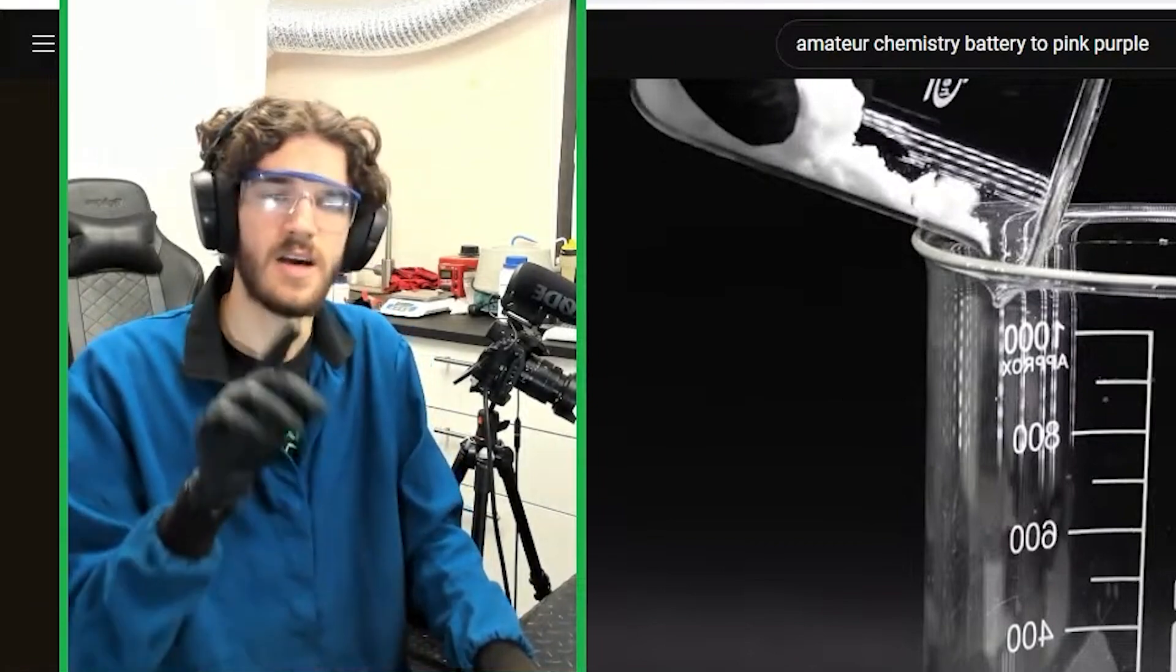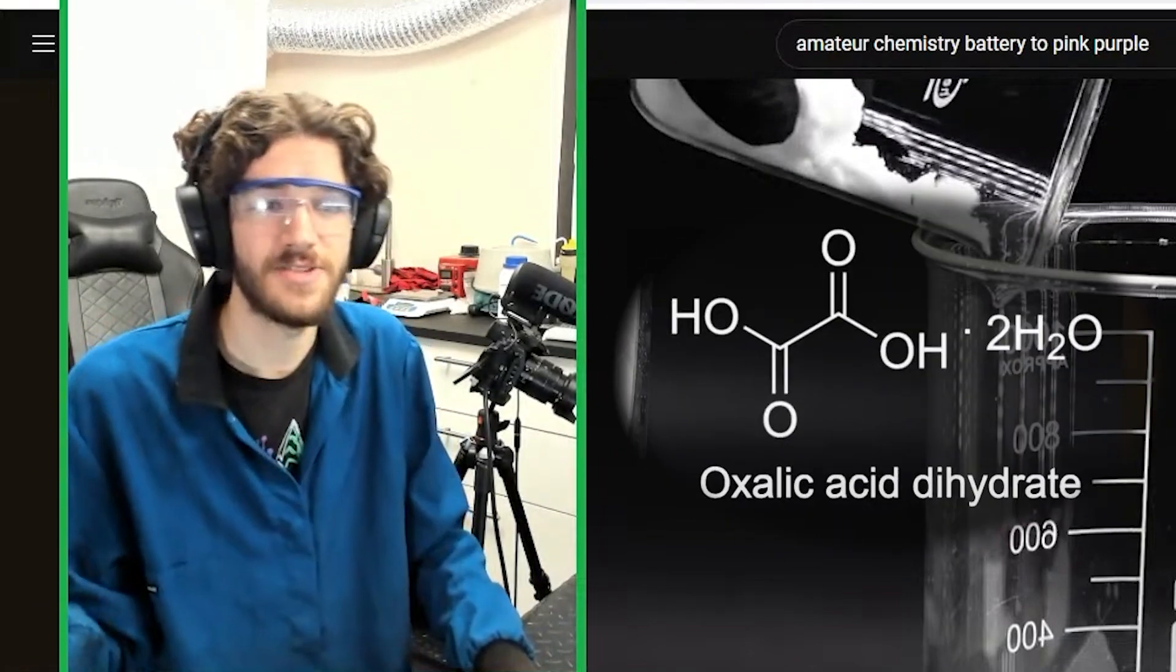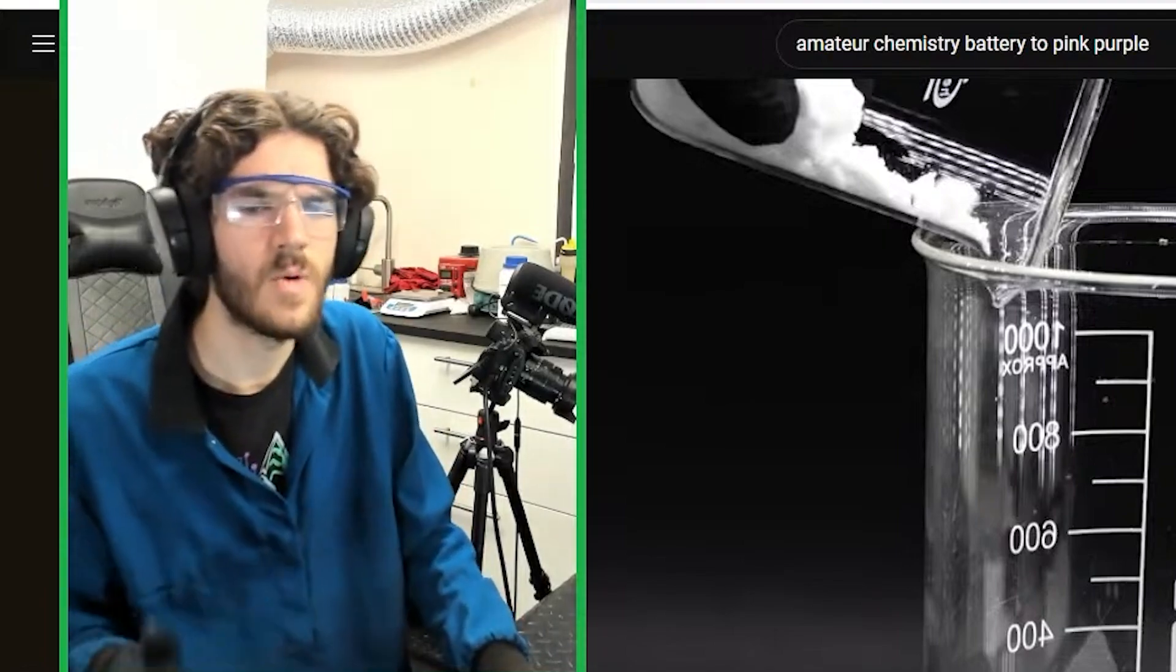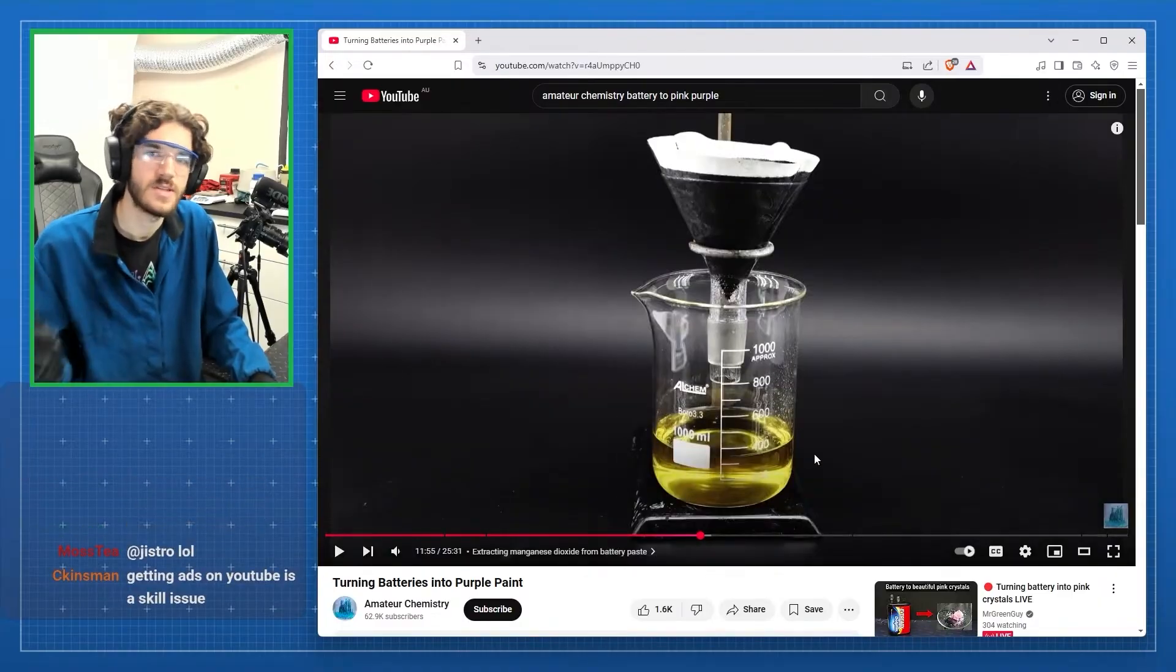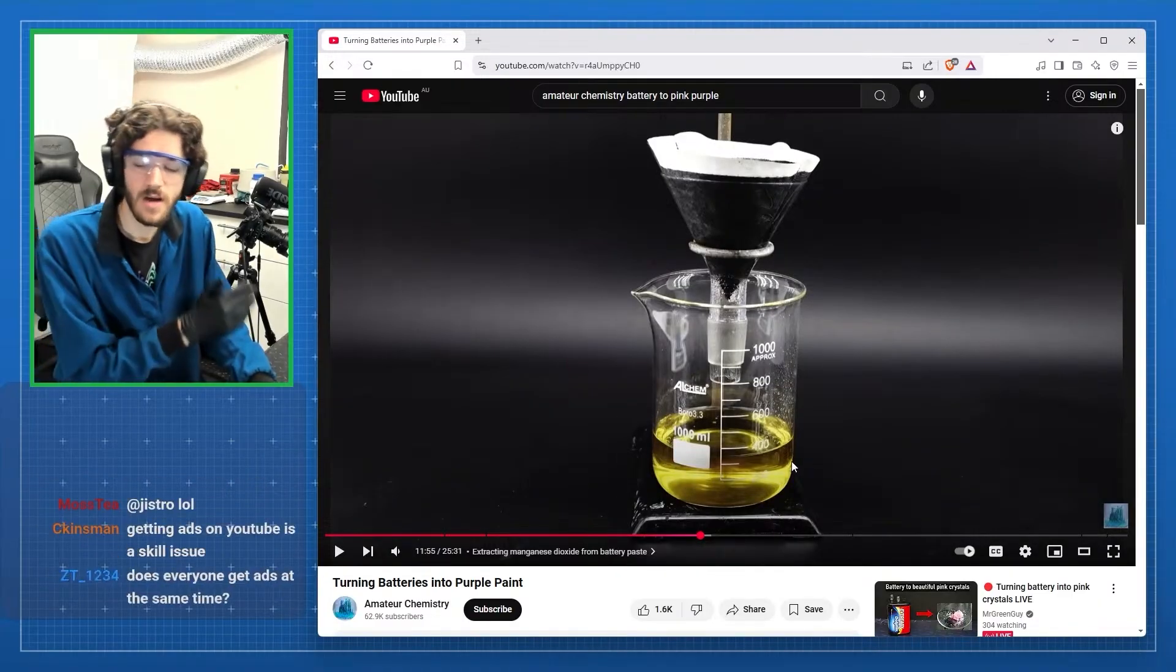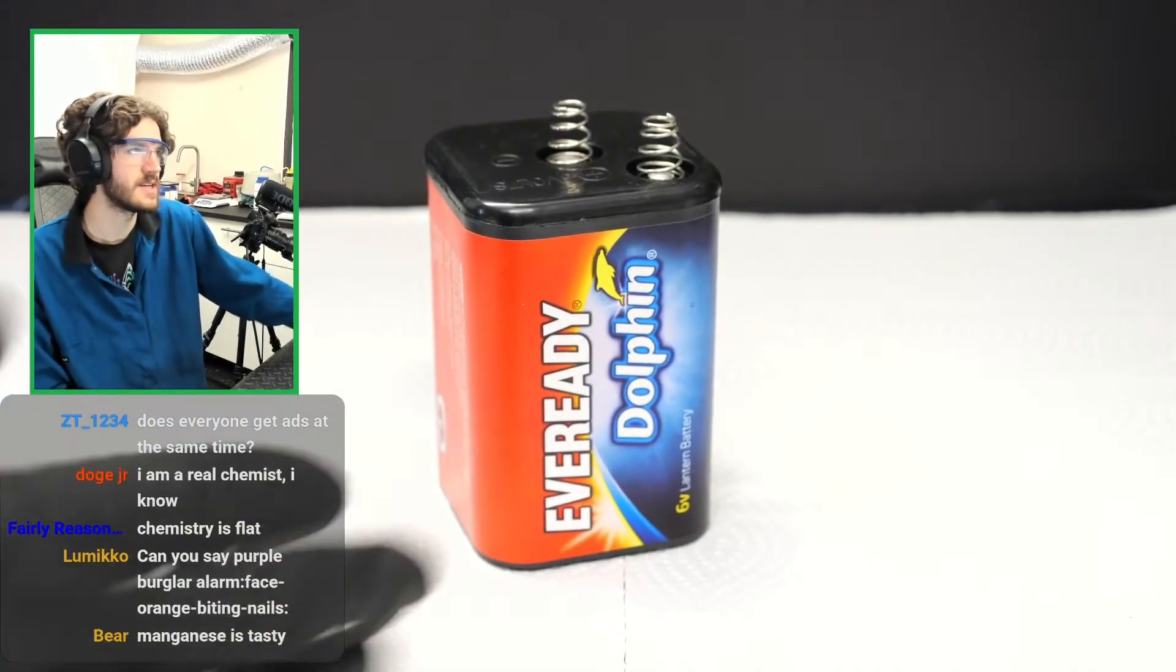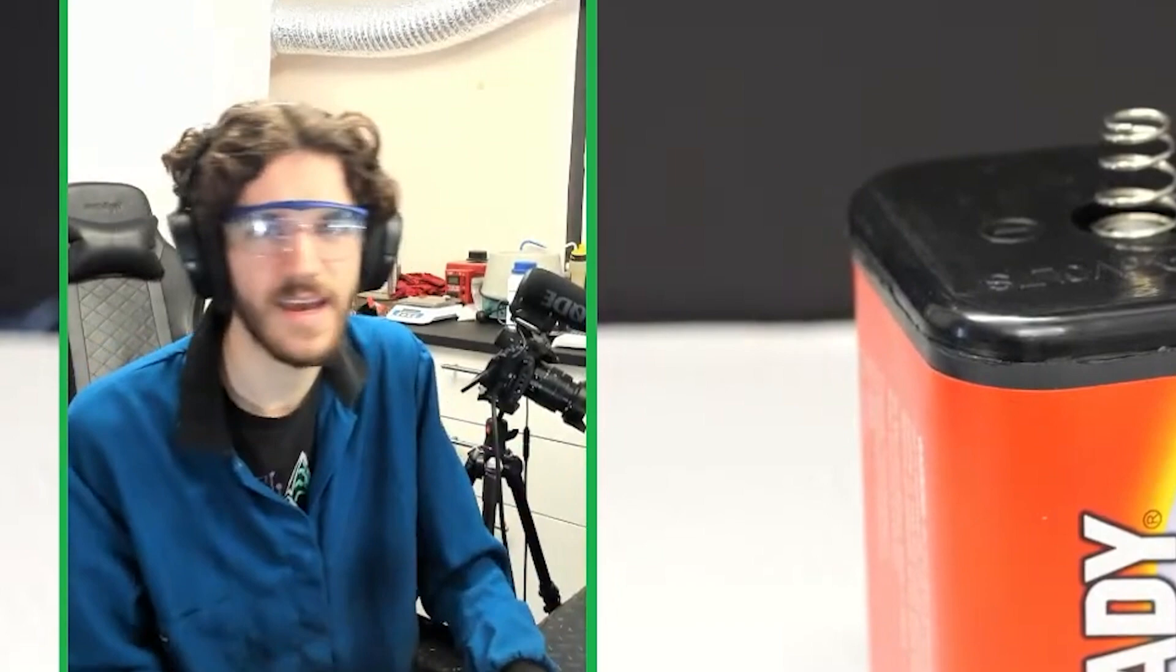Now this is where it changes for me. I don't have oxalic acid dihydrate. So instead I'm going to be using hydrochloric acid, which should still work. He then just filtered it once he got the manganese dissolved. That leaves behind the carbon. We'll probably see some mess everywhere, which is why we have everything on some paper towels here, because it's such a messy process. I absolutely hate it.